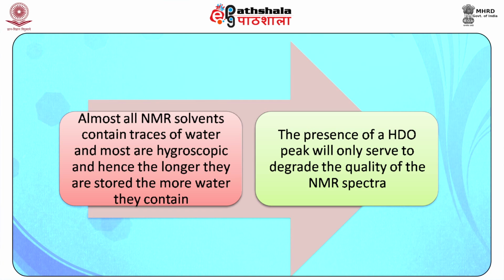Almost all NMR solvents contain traces of water and most are hygroscopic, and hence the longer they are stored, the more water they will contain. The presence of an HDO peak will only serve to degrade the quality of the NMR spectra.